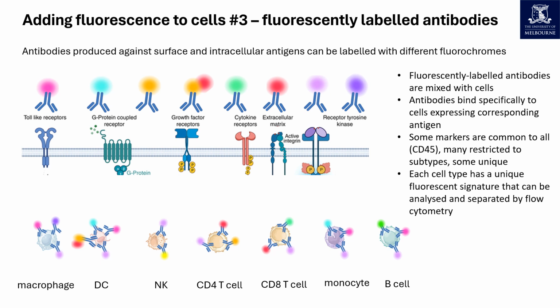Immunologists have pushed for the development of increased cytometer capabilities and improved fluorescence reagents, and consequently, our knowledge of the immune system has exploded through the ability to perform more complex analyses. There are publications and other reports that have successfully used 50 or more cell surface fluorescently bound antibodies to subtype cells in the immune system.